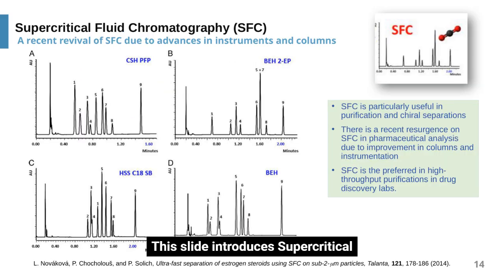This slide introduces supercritical fluid chromatography, SFC. SFC is particularly useful in purification and chiral separations. There's been a recent resurgence in SFC in pharmaceutical analysis due to improvements in columns and instrumentation. SFC is preferred in high-throughput purifications in drug discovery labs.